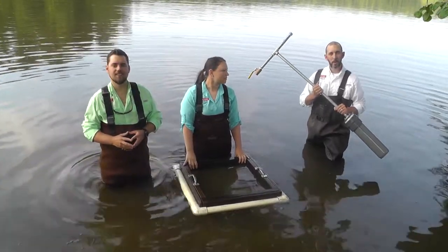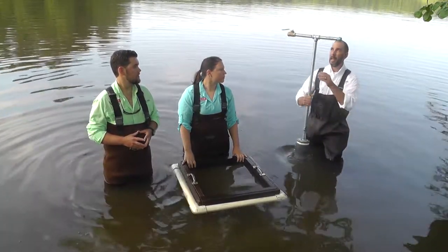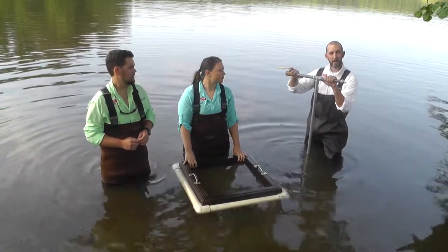What I have here is a tuber core sampling device with a four-inch PVC corer, and here on top we have a valve that creates suction.